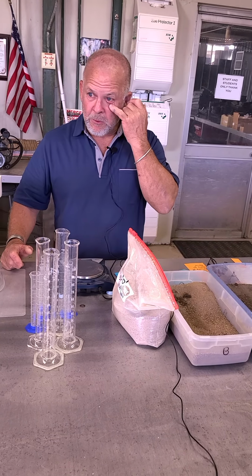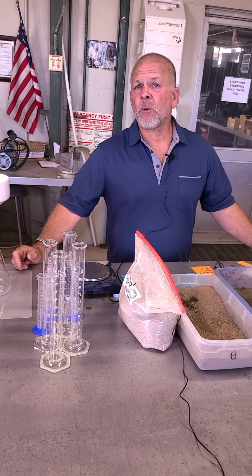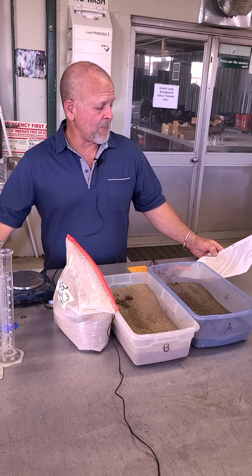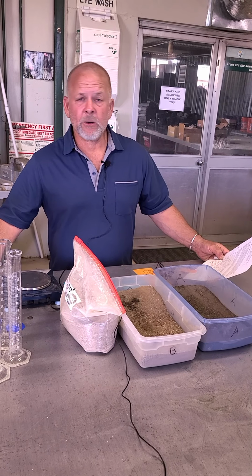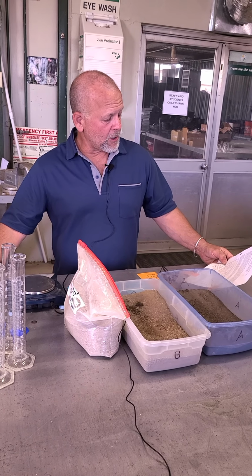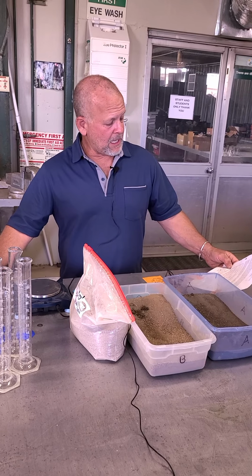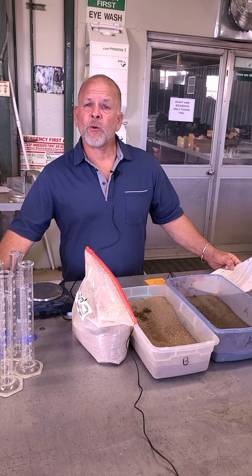So we've got 4 different salt treatments. Our first is just plain pure water, nothing in it at all. Then we have what we're calling a saline water, and that one has dominantly calcium added, and then some sodium. Then we have a sodic water, which is reversed. It has a little bit of calcium and a lot of sodium. And then we have what we are calling a saline sodic water, and it has a lot more of both. It has a fair amount of calcium, but almost 4 times as much sodium.